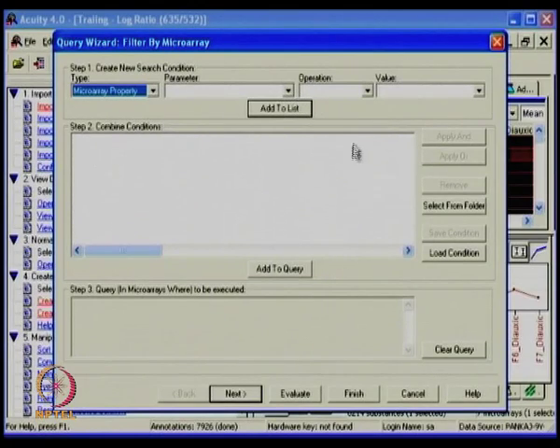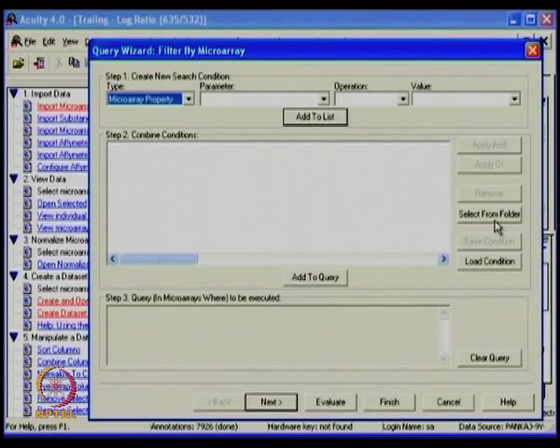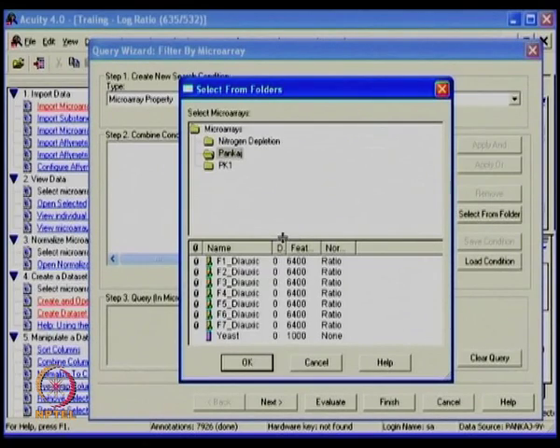This is a little tricky because if you have the same name multiple times, the data will be imported twice. So you need to make sure your folder is right and that you have given only one copy to avoid that. So I can select a folder and say I am in this particular folder and I want to import all the data from that.